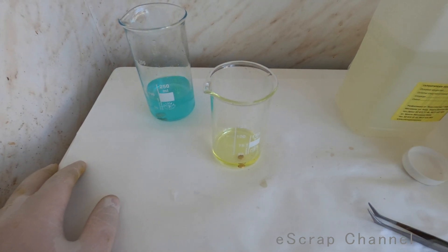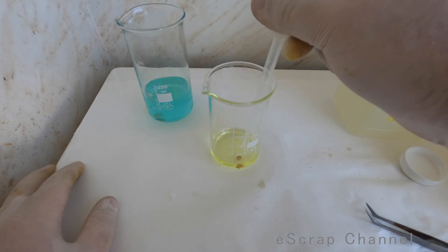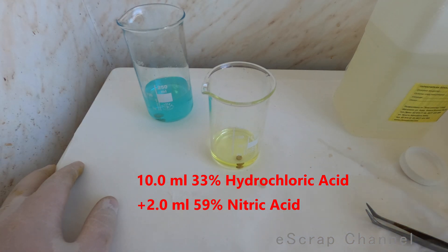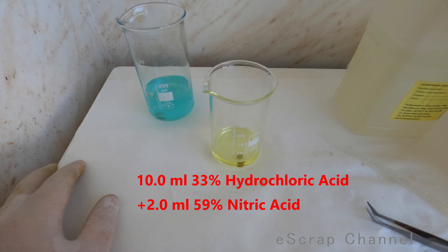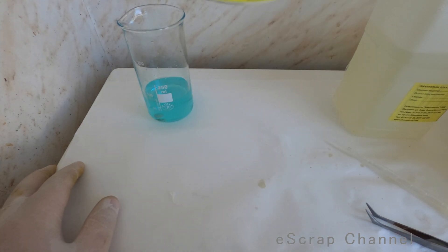I will add 2 milliliters nitric acid now and let's start dissolving this gold. Bubbles already started so let's wait for it. It will dissolve probably in 30 minutes.